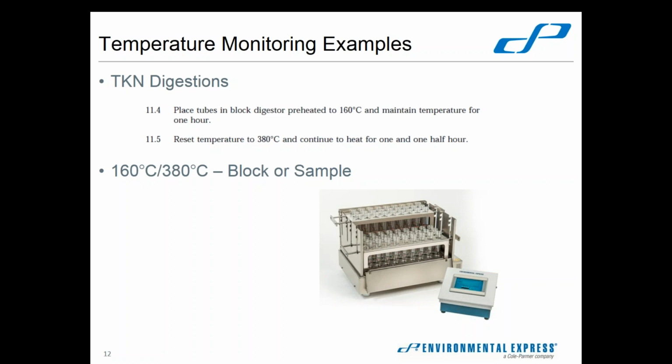And it's really hard to find a liquid that is still a liquid at 380 degrees Celsius and is still something that you can use a regular thermometer in to actually measure the temperature. Concentrated sulfuric acid will work, but that's a problem because then you're trying to take the temperature of boiling sulfuric acid, which is not an easy thing to do. You could try putting some of your sand in a tube and stick a thermometer down in there.